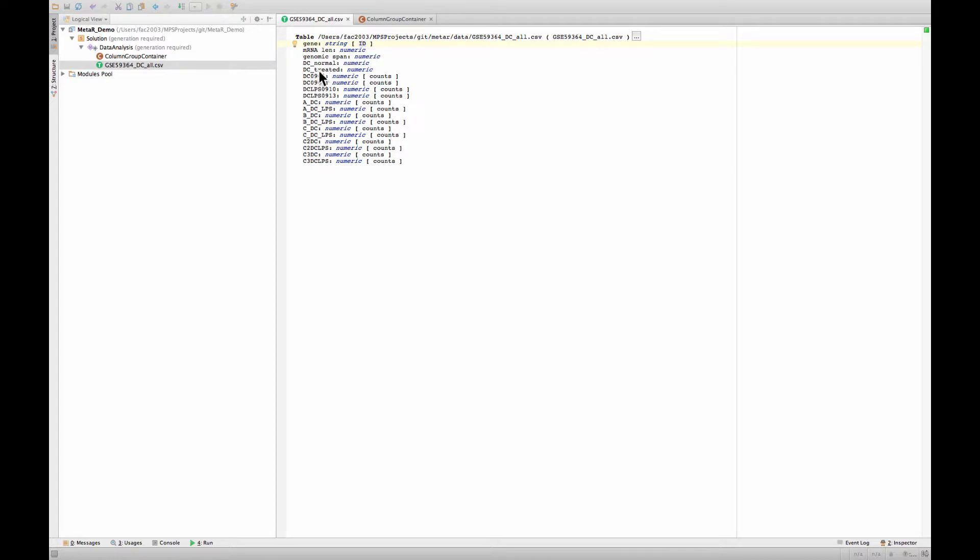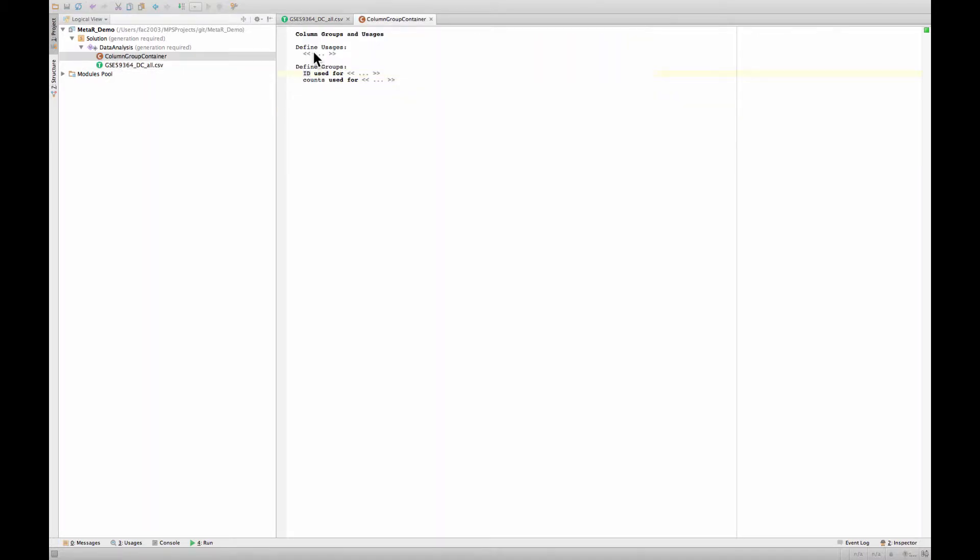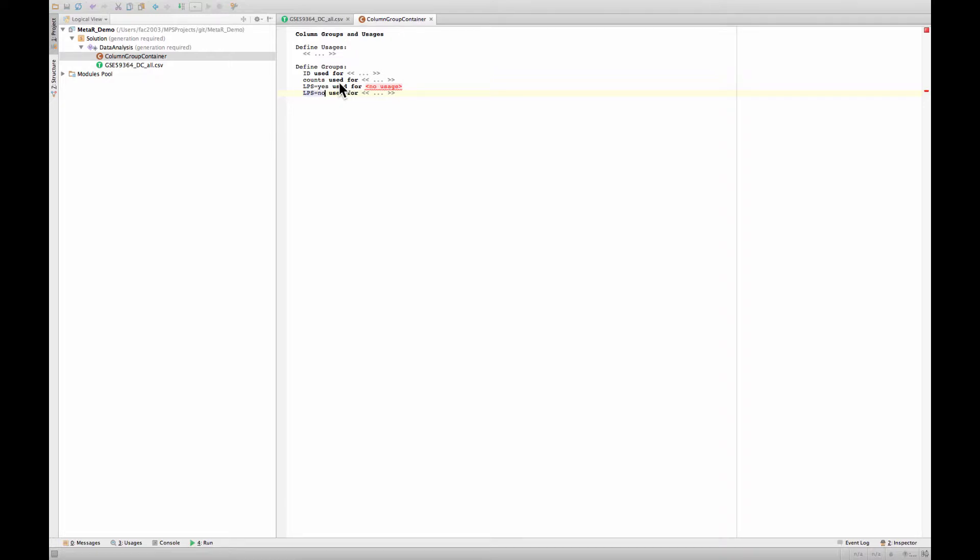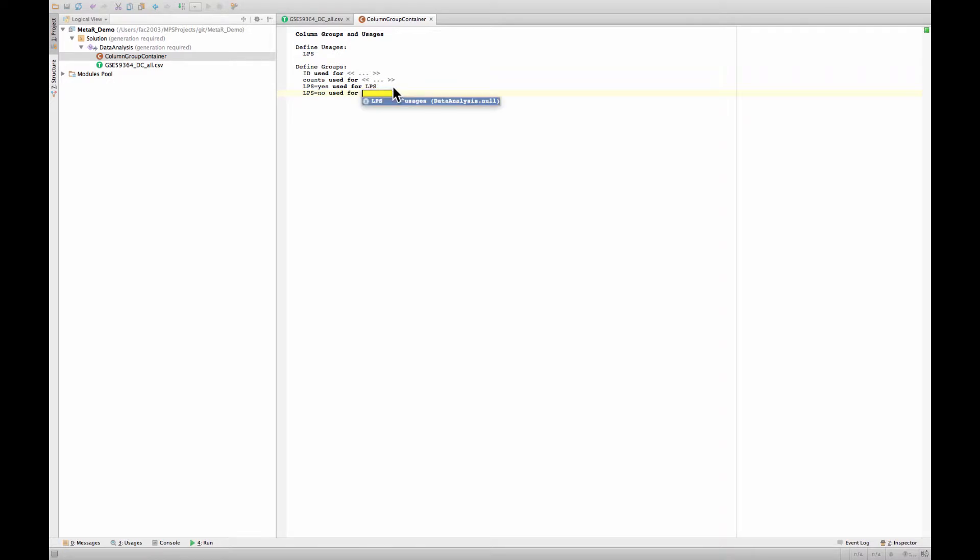And to indicate what columns contain counts. There's a little more we can do because you can notice that some of those columns have LPS in their name. This indicates that the samples that the columns contains a count for were treated with LPS. So we need another group for that. We need two other groups for that. We have samples that were treated with LPS, and we also have samples that were not treated for LPS. Now I'd like to know that those two groups are related, and the way I do this is I define an LPS group usage here, and I will simply bind those two groups, yes and no, to the LPS usage.